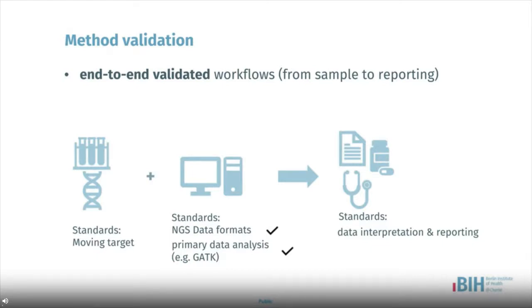So in the realm of bioinformatics data analysis and also data management, a considerable level of standardization has been already achieved, for example, by introduction of data formats and implementation of tools for primary data analysis. The tools for clinical data interpretation and reporting are still largely at their infancy. However, it has to be said that in the last few years, a considerable effort went into their conceptualization and development.